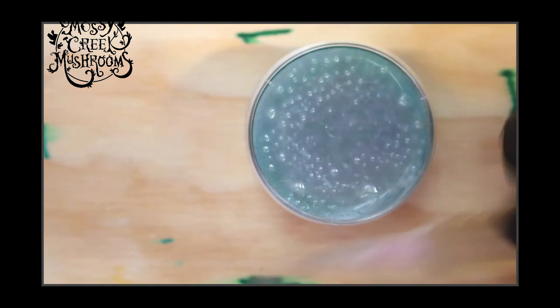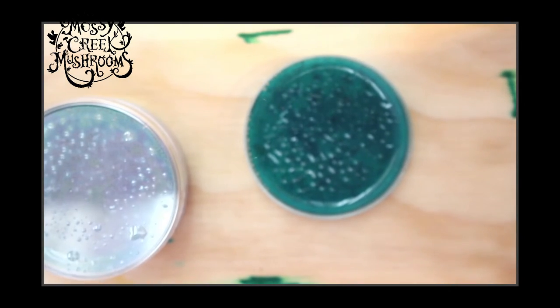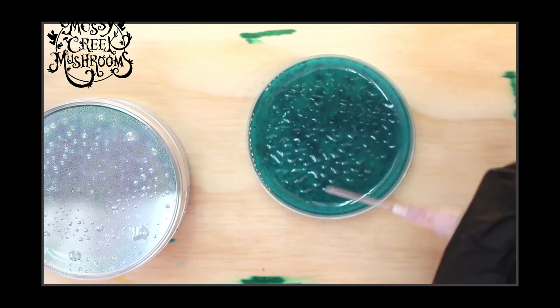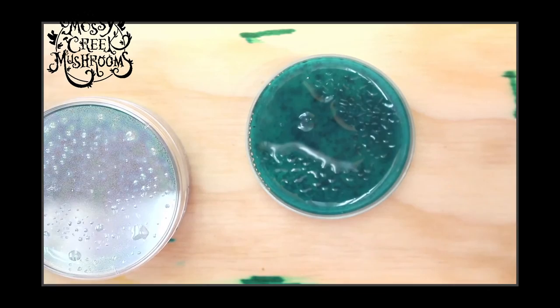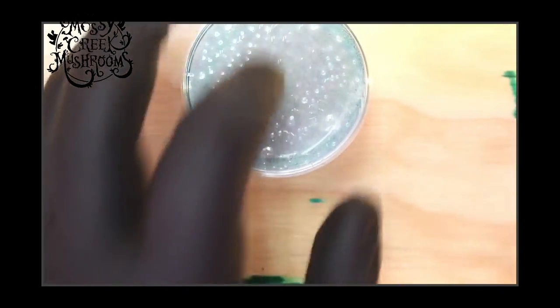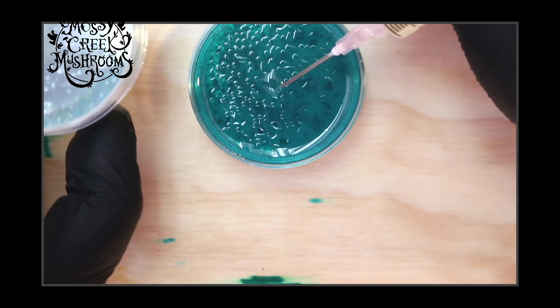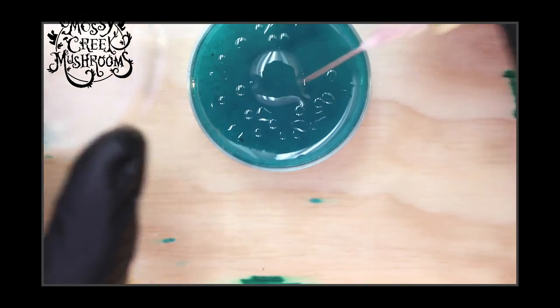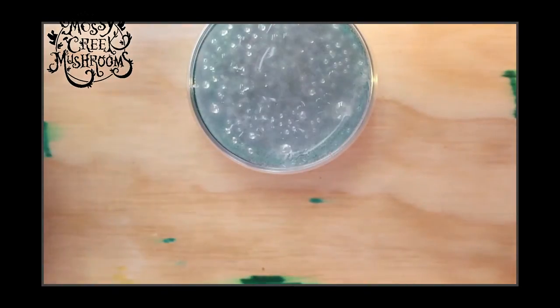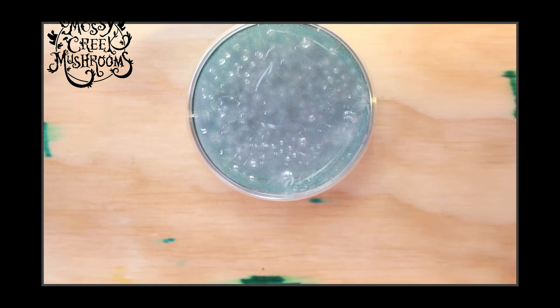This is dirty liquid culture — this is how you test liquid culture. It is very simple: you just take your liquid culture that you're wanting to test and put a couple of drops on a plate. We'll parafilm those back up. I'm going to guarantee you that next week when we come back to check these, they're going to be very bacterial. When you have milky-looking liquid culture, it is almost always because of bacteria.